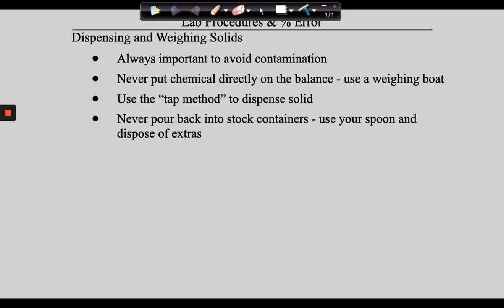If there's already one in the beaker, it's a different story. So, guys, let's say that we bring our own chemistry spoon. So what are we going to do? We're going to come along, we're going to put this on there, we're going to hit re-zero. Then guys, you're going to scoop up a big old scoop of salt.